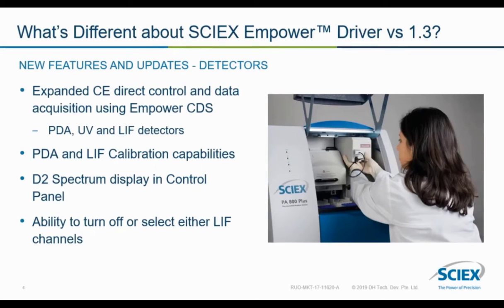Along with the expanded calibrations, the D2 spectrum display can now be seen in the control panel. We also have added the ability to turn off or select either LIF channels in this latest version of the driver.